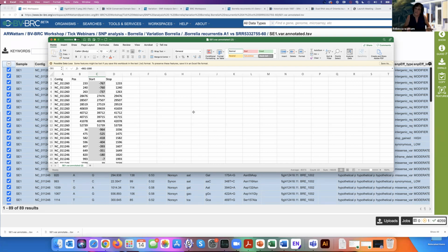And also when you download everything in Excel, which I always do, that first table I showed you that showed you everything, it gives you the names of all those things, and you could just do a conditional format and look for outer membrane, because generally they'll have that name, and then you can just get rid of those if that's what you want. But you can't mask them pre-analysis. I think, Sally, maybe that's what you were asking. No, sorry, Sally, we cannot do that.